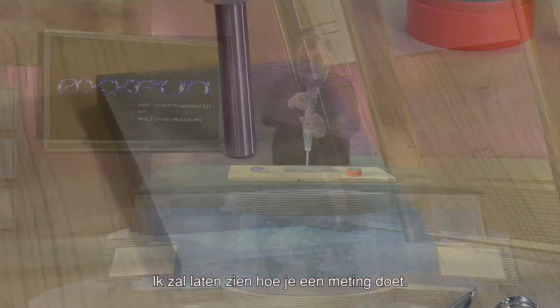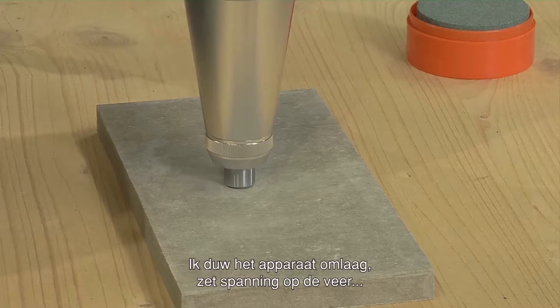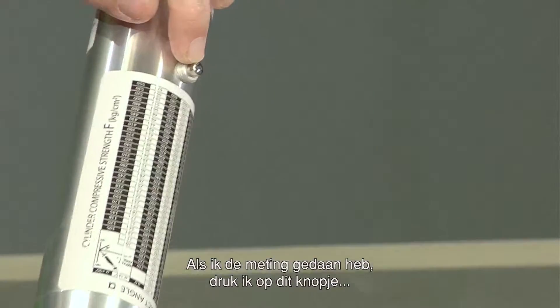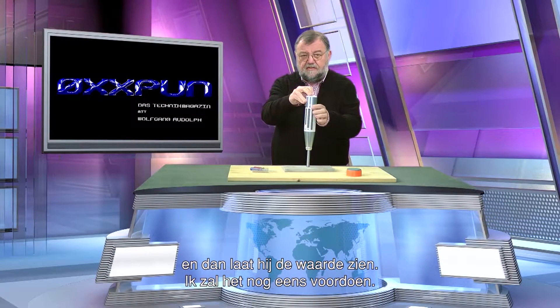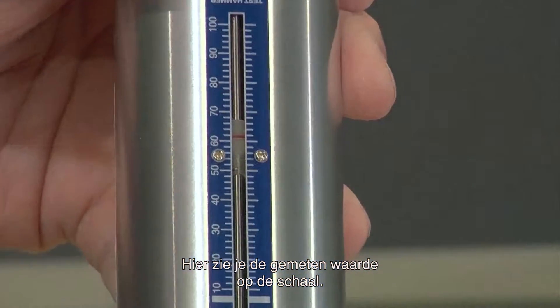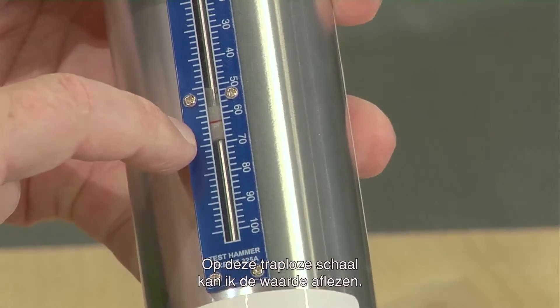Now I will show you how one measurement works. I push the device simply downwards, tension the spring, and the bolt is triggered. And that is all. There is a button at the back. When I have done the measurement, I push the button and then I get the result shown. I'll show you again. Now the bolt stays inside. And I have here a measured value on the scale. Now I have to turn it around, and on this dimension-free scale I have a value which I can read.